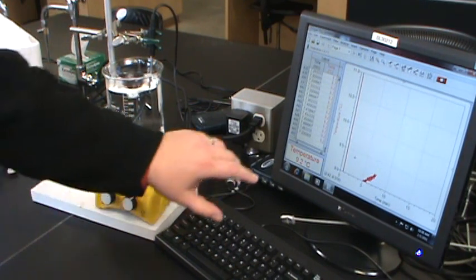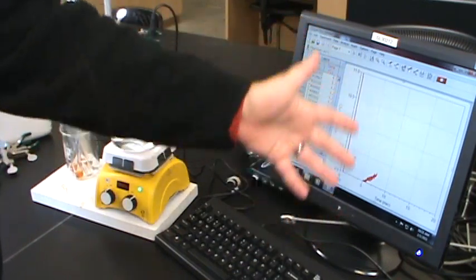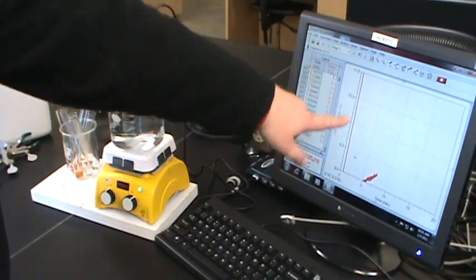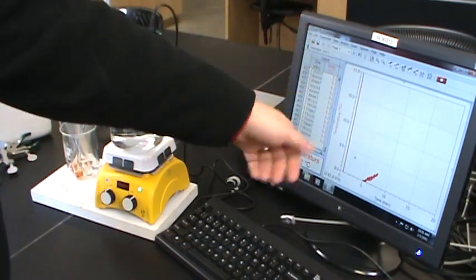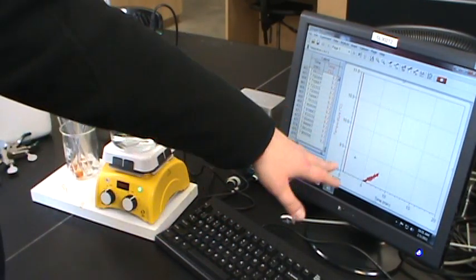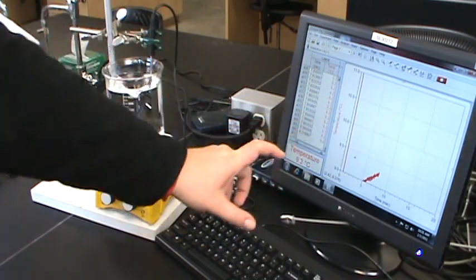Now when we're doing our cold run, we want the temperature to be fairly constant. So how constant does it have to be? In a perfect world, it would be absolutely constant. But as long as you can keep the temperature within a couple tenths of whatever temperature you want to run your experiment, we should be fine. It doesn't have to be exactly 10. If you want to run it at 9.5 or at 10.5, that's fine. But try to keep it within a couple tenths.